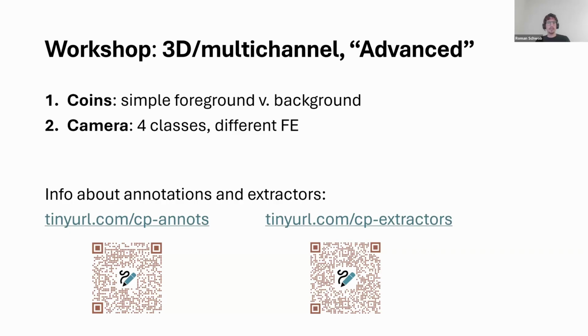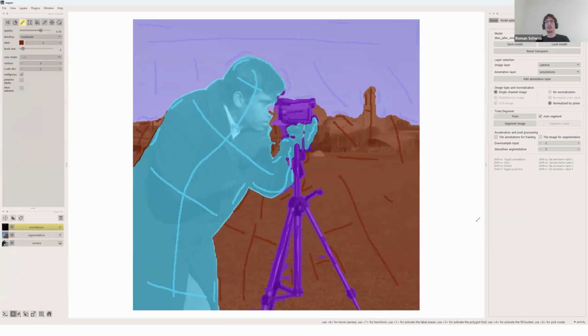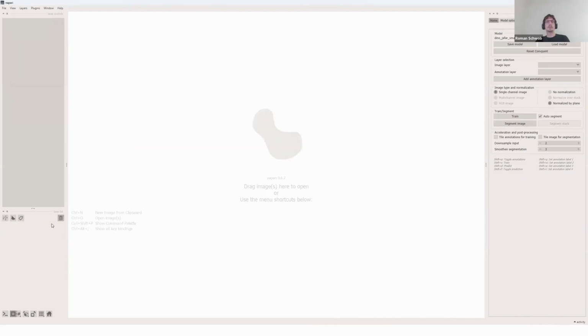Let's actually jump into some examples. I hope it becomes clearer then. So let's close what we had so far.